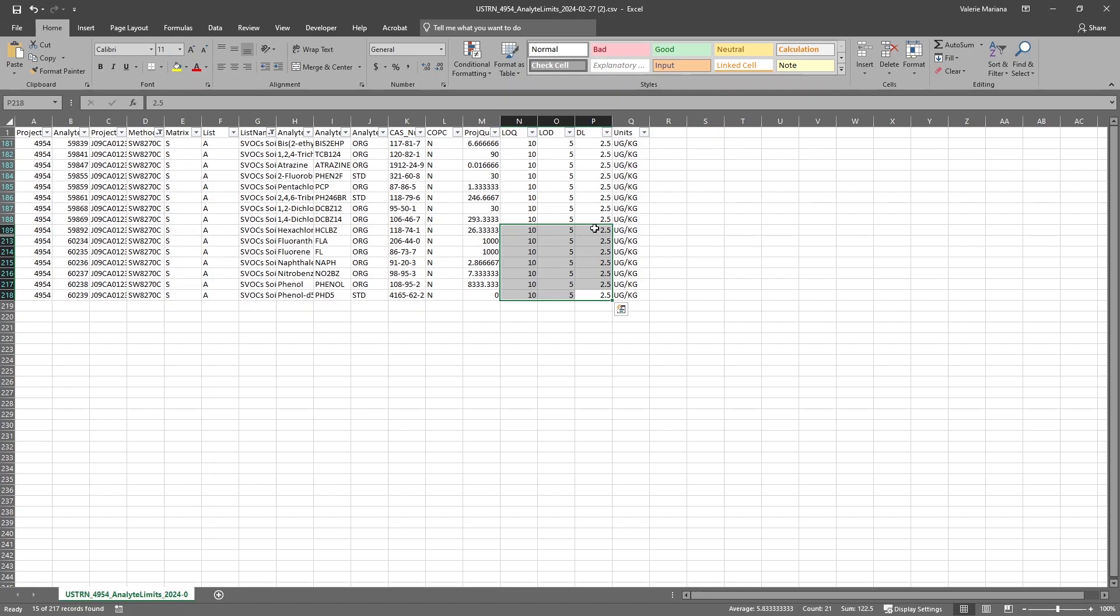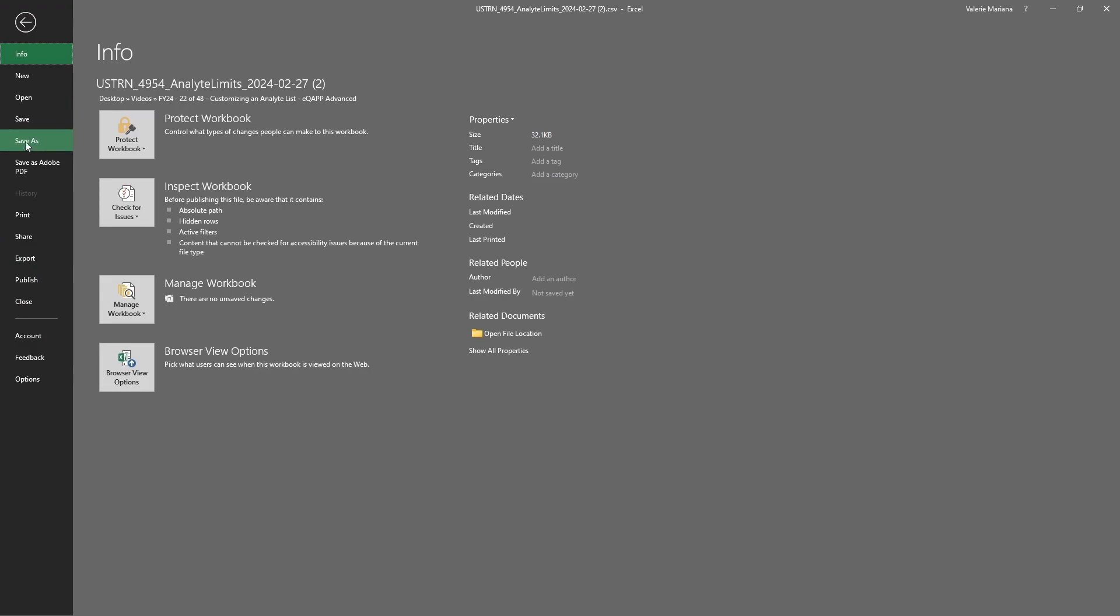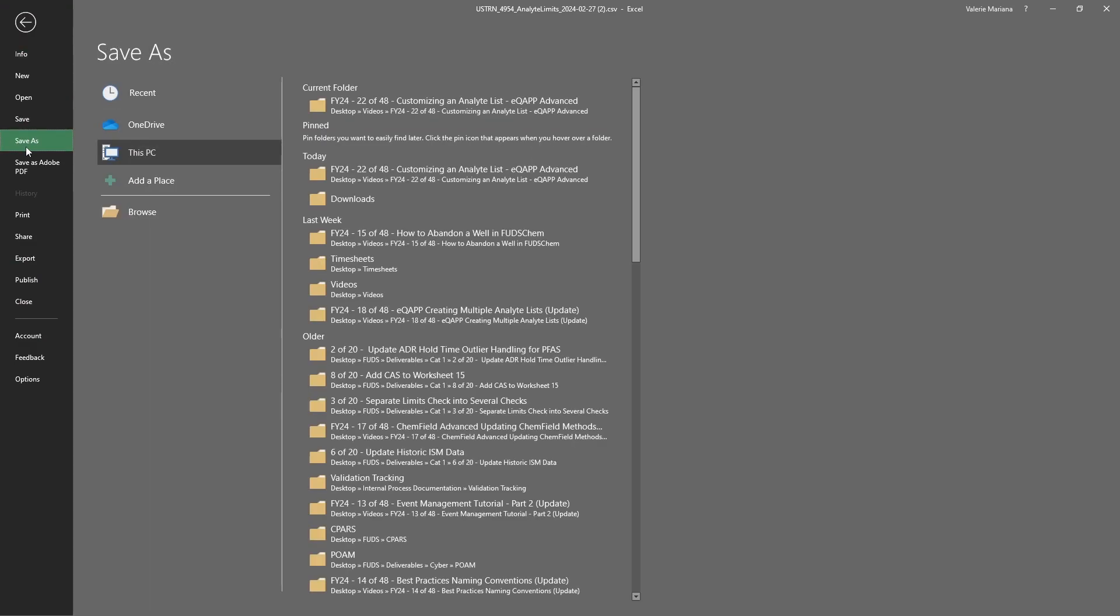Once we've finished editing, we will save the file as a CSV. It is important to save it in this format.